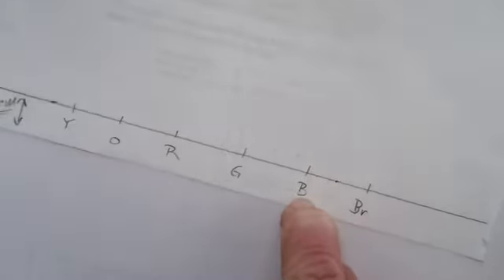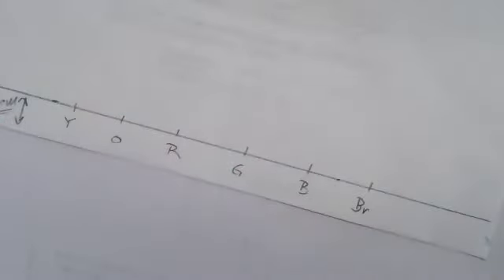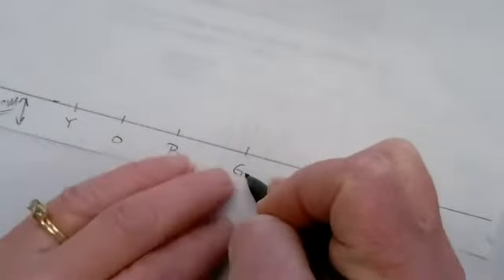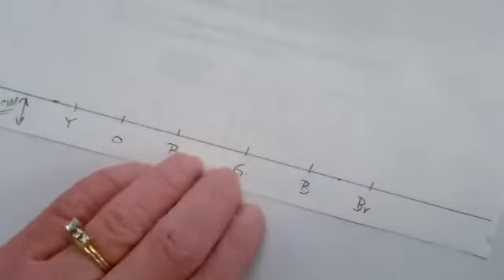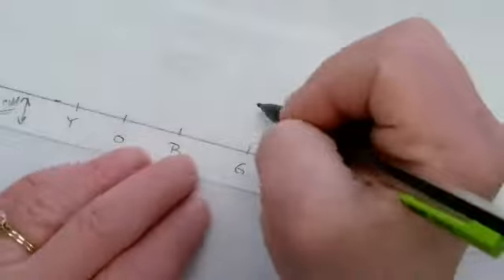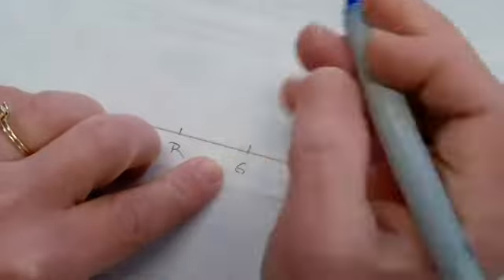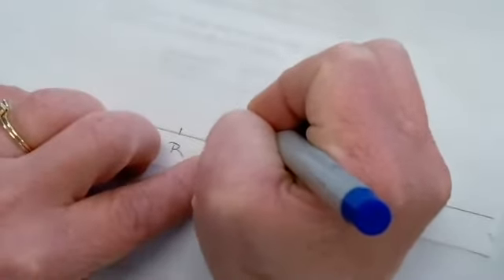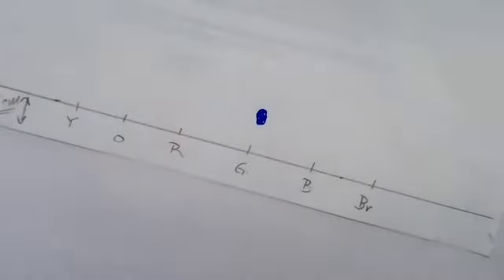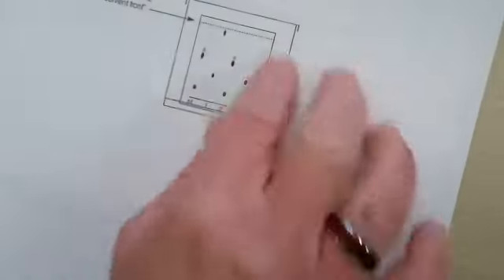As the liquid moves, you'll see traveling and possibly separation. So for example, let's say green. Let's say M&M uses blue and yellow to make green. So you may observe that, maybe after a couple of minutes, first the green is traveling together, and then you start to get a blue spot, and then a yellow spot. Okay, so we're going to get a series like is on this packet of dots.